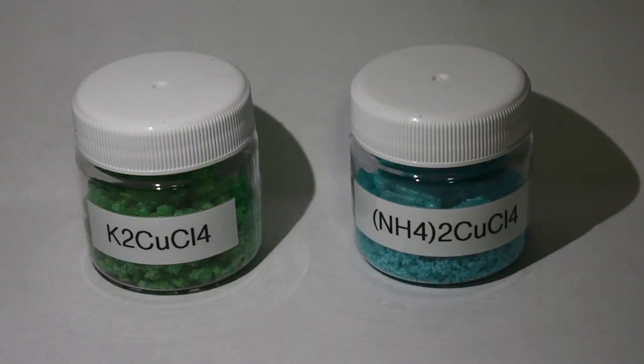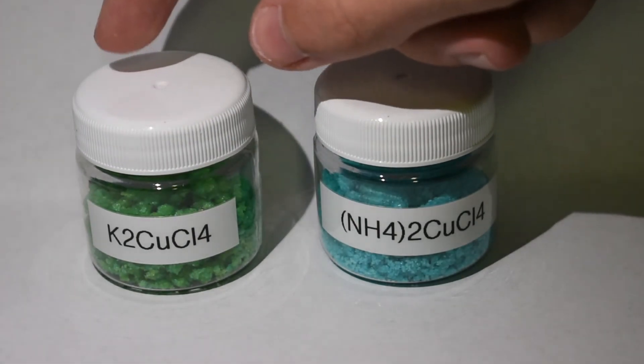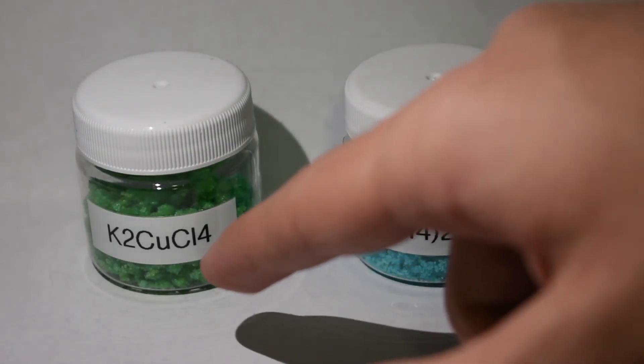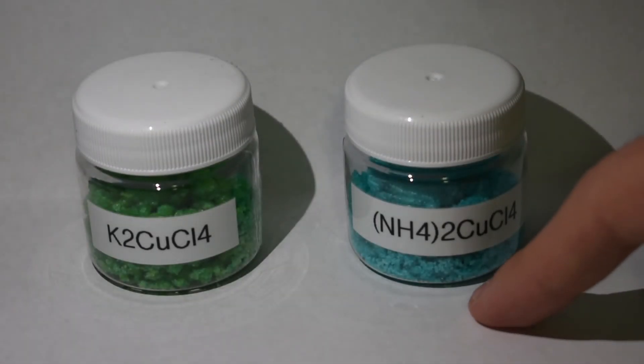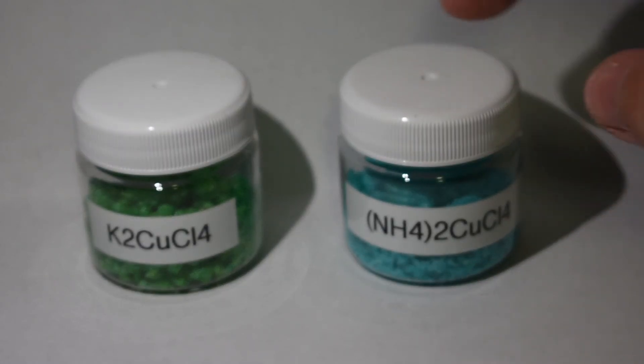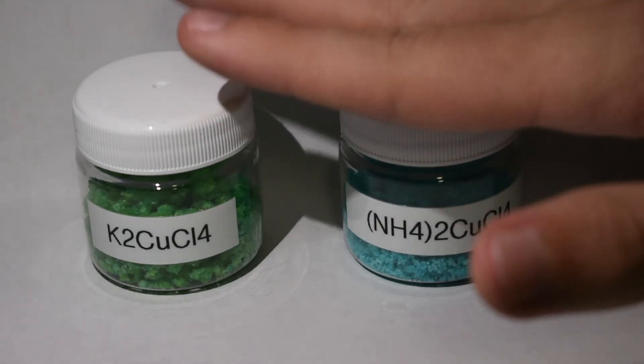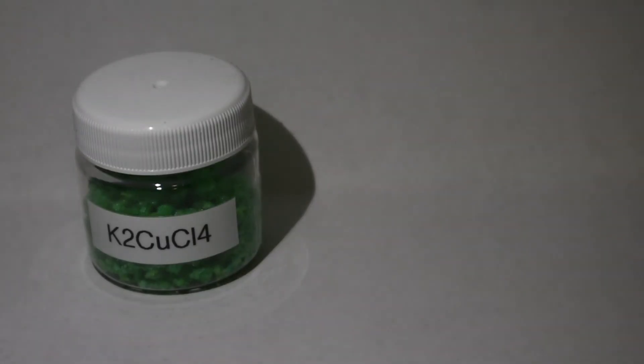Here are our final products. We have our ammonium tetrachlorocuprate and our potassium tetrachlorocuprate. And after massing them, we got a 96.1% yield with the potassium and a 97.8% yield with the ammonium salt. And that's probably due to transfer losses and what not. But overall this is a really good yield for what it is, it's basically just combining two salts and evaporating it. And the color is very nice.